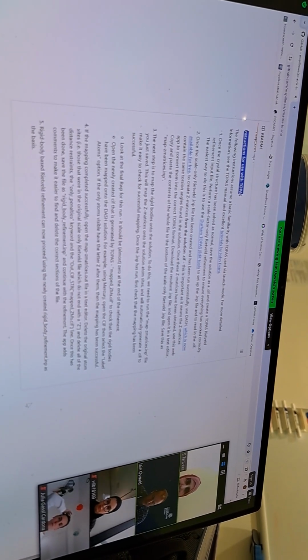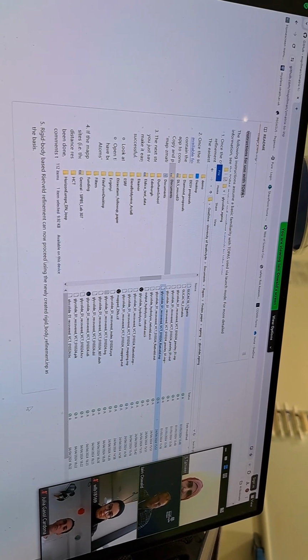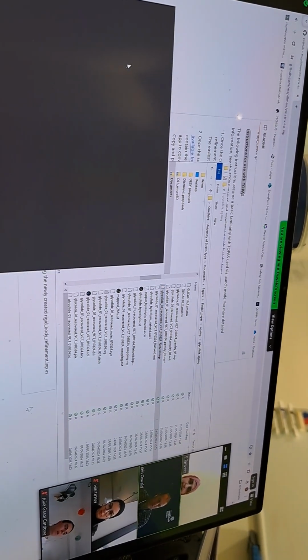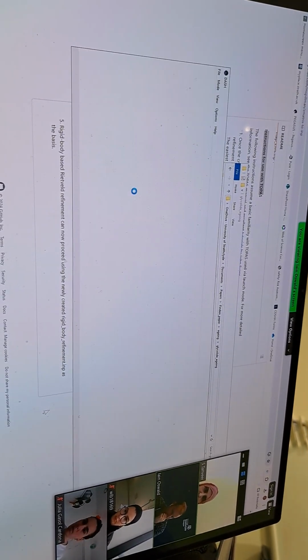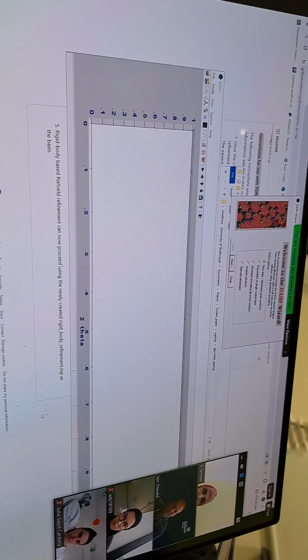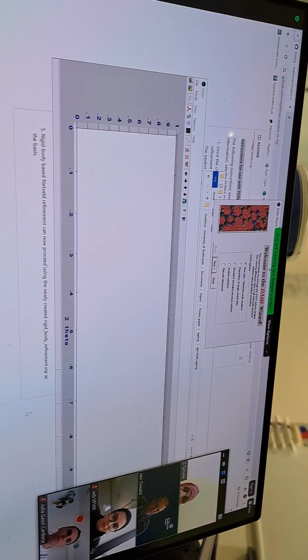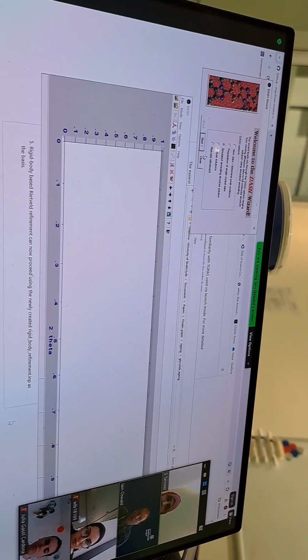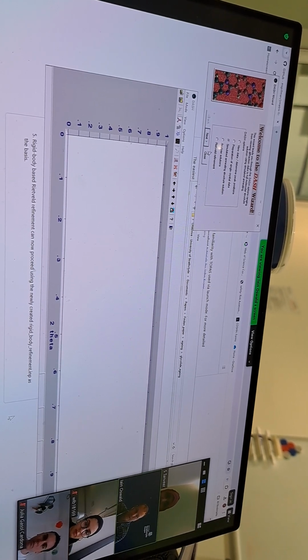You have used DASH. Okay, so if you've used DASH before, we can use it as a way to convert files or coordinates into the correct system.